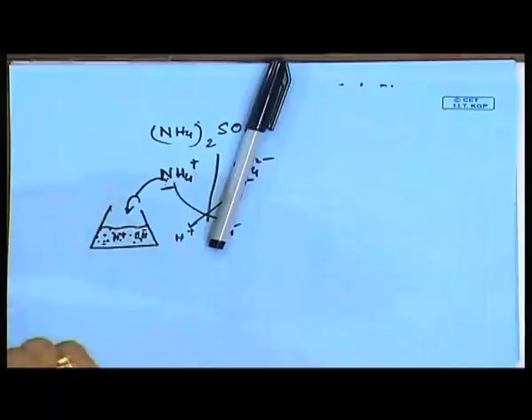So, what we are doing? We are adding some salt for stronger binding, because we know that hydrophobic interaction is not that strong a binding. To enhance this binding force, we add salt, and during elution we withdraw the salt.